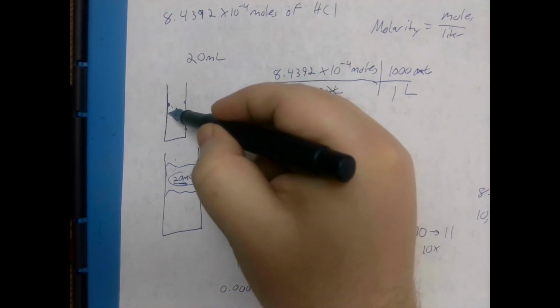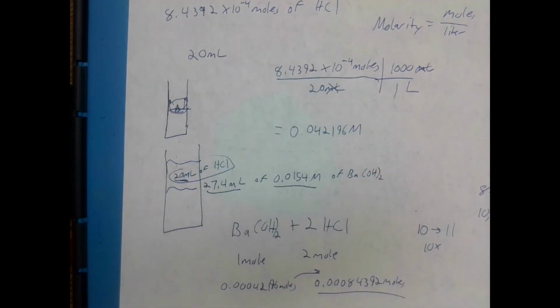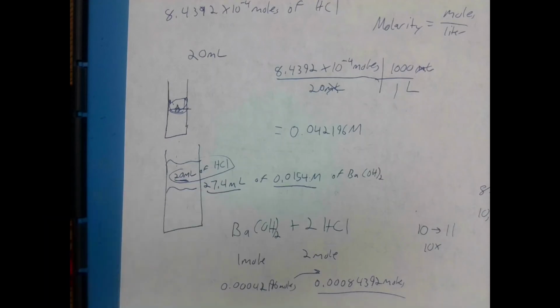Occasionally you can swirl upward and collect a drop, and your solution instantly clears up, and you don't know why. Restart over. So it's very frustrating to get accurate. I did manage in my class to get a perfect solution. I do not remember if it was my first time, but I know the professor was impressed on how clear it was.